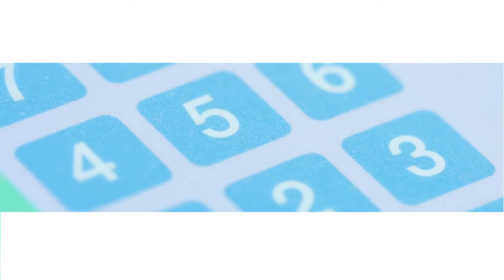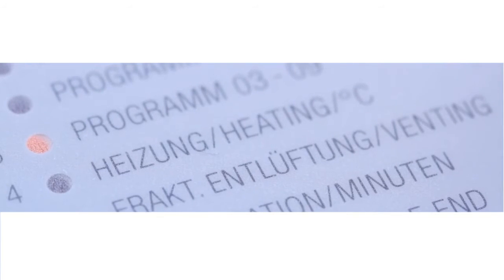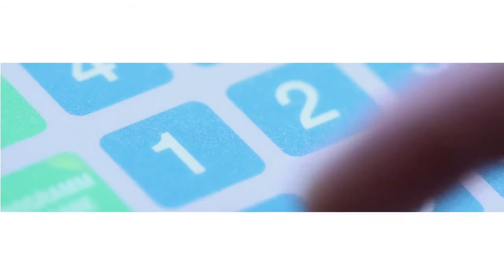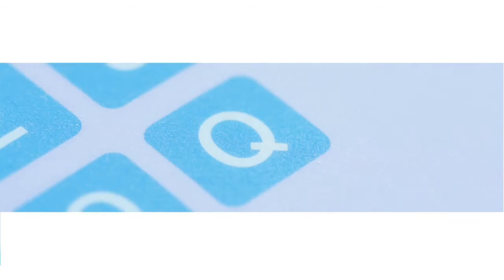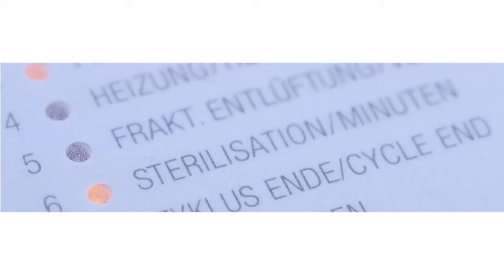Now introduce the desired program parameters. The left side light indicates the setable parameters. Once you've entered the desired values, confirm with Q and set the next parameter if necessary.